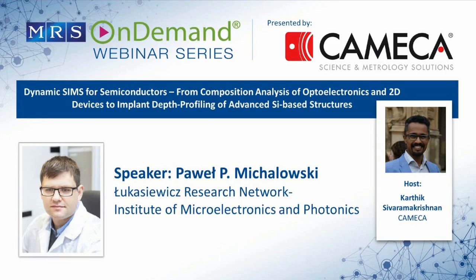Thank you to MRS and Dr. Michałowski, who is a prolific user of our CAMECA SC Ultra. In this talk, he will give a quick overview of dynamic SIMS basics and then cover some interesting use cases for low energy dynamic SIMS. Which is an area of increased interest in the SIMS space due to the move, especially in semiconductors, towards thinner films of a few nanometers, ultra-shallow dopants, and 2D materials, for example, graphene.